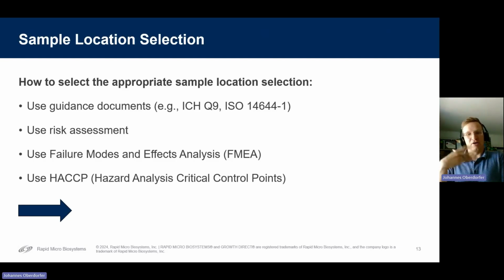So thinking of a clean room or maybe a locker, if we think, okay, where the people entered, this is a risk, this is the highest critical spot, then already you failed with your risk assessment because you concluded before you even did the assessment. So it's hard not to get into subjectivity, but you need to maintain objectivity with these risk assessments. Otherwise, this is not representative and it will lead you to a wrong conclusion.